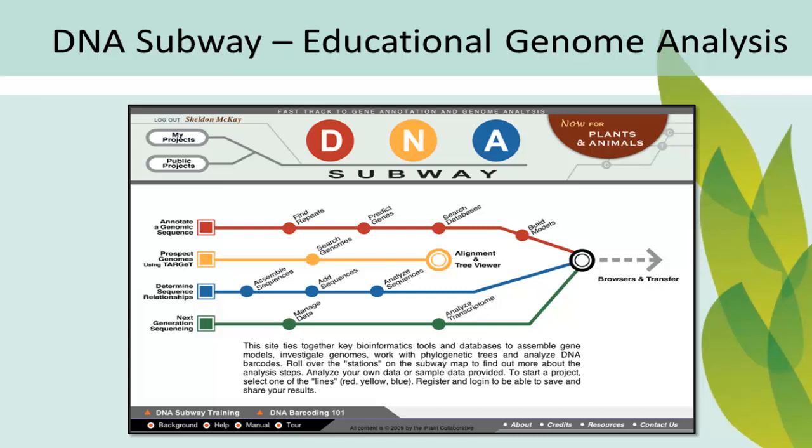DNA Subway is the iPlant platform for educational genome analysis. DNA Subway bundles research-grade bioinformatics tools and databases into intuitive workflows, presenting them in an appealing interface modeled on the metaphor of a subway map.